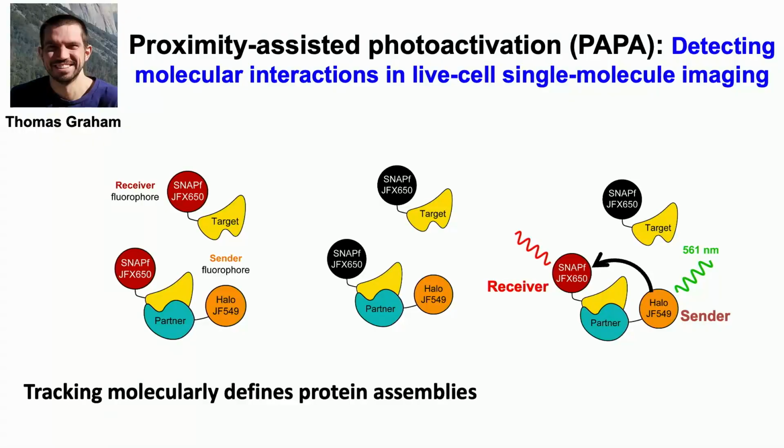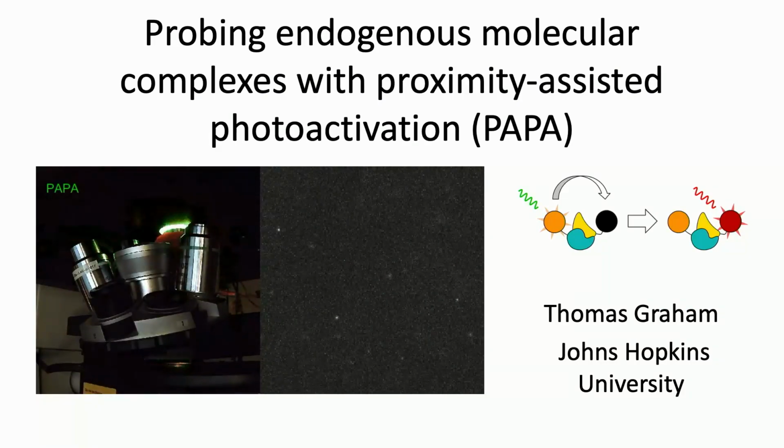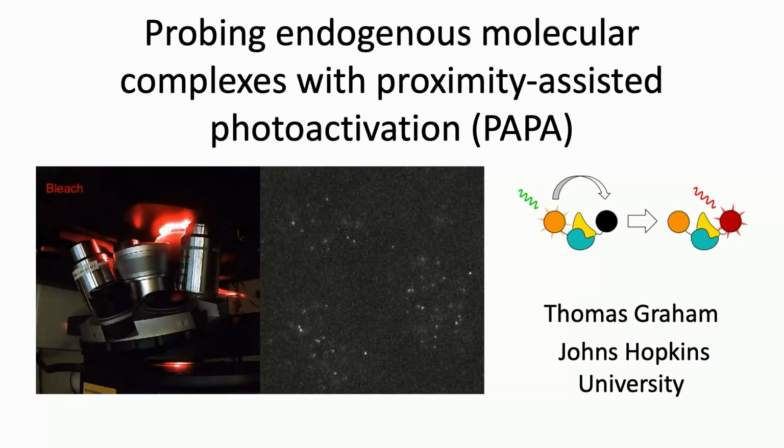Right? This is something we knew we could do with a UV laser at 405 nanometers, but we didn't know we could do it with a 561 laser, and especially not as a function of the presence of another dye. So all of a sudden, he had a tool to interrogate whether his molecules were alone or whether these molecules were in the presence of a partner, and so he could interrogate the proximity of these 2 dyes in cells and reactivate fluorophores as a function of the proximity of another molecule. So this is really what we're doing in these experiments.